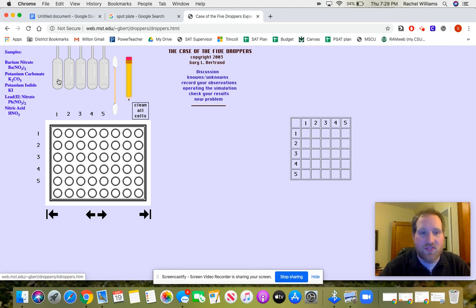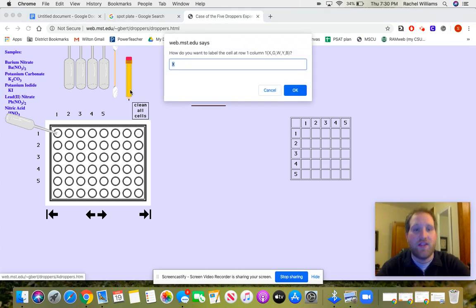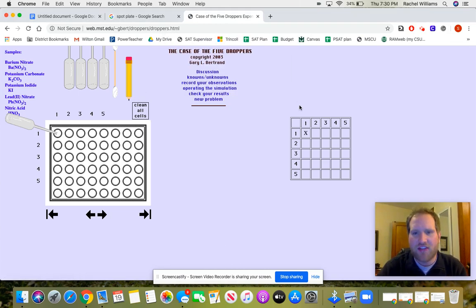So what you're going to do is the same thing. You're going to take dropper number 1 and go down the line. Dropper number 2, down the line. Or you could start by going across. Or you can do one cell at a time, doesn't matter. Dropper 3 down the line, and so on. All right, you get the idea. And now, once you have those done, we're going to go across. So number 1 here, probably no reaction, makes sense because number 1 added to number 1, nothing's going to change. So you hit this and you call it X for no reaction.